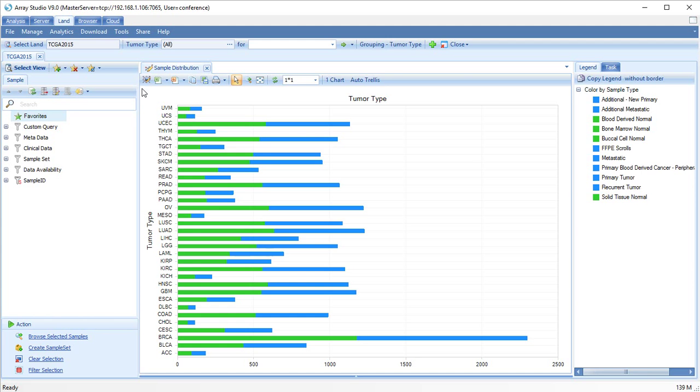Oncolan provides a set of functions to scan samples for the top genes in a sample set, ranked by transcript expression, fusions, mutations, and more.